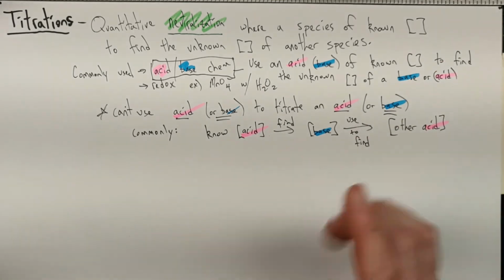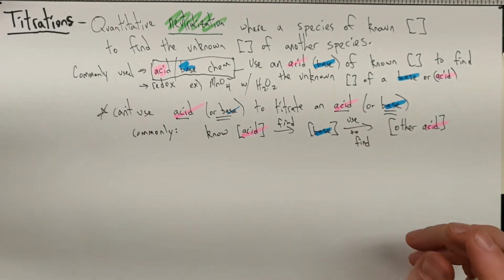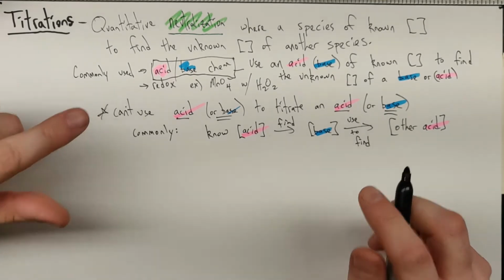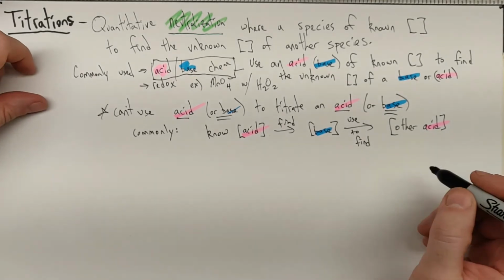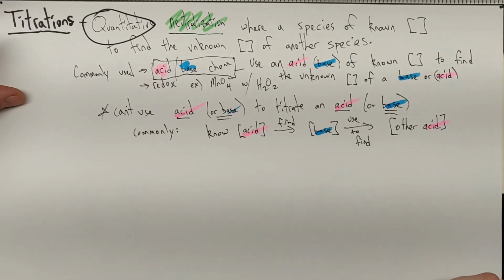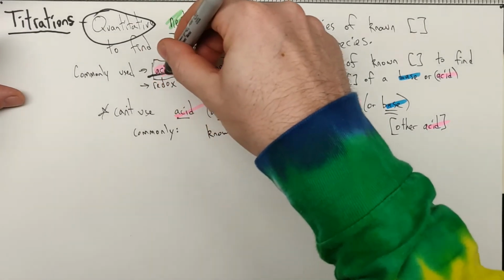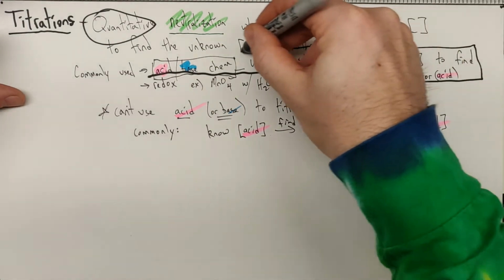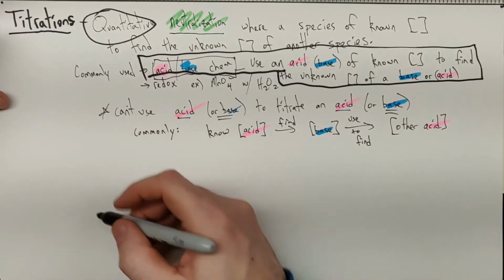All right, so as we're looking at this, there's a characteristic graphical representation of titrations, and that's something we really need to spend some time on. We can get good qualitative information from it, but we can also get really good quantitative information, and I guess that's the basis for titrations. So we will look there. All right, so that's what we're going to be looking at.